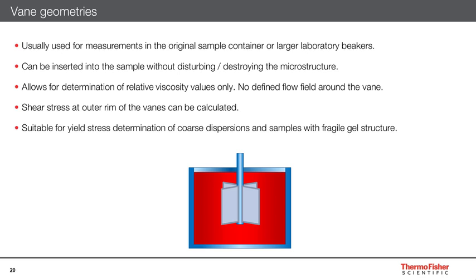Since the shear stress at the outer rim of the vanes can be calculated, vane rotors are suitable for measuring the yield stress of coarse dispersions and samples with fragile gel structure.